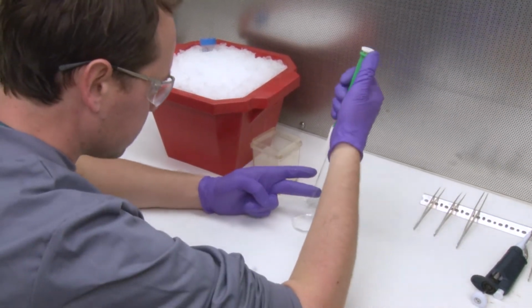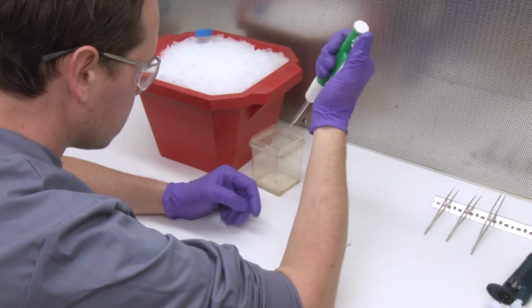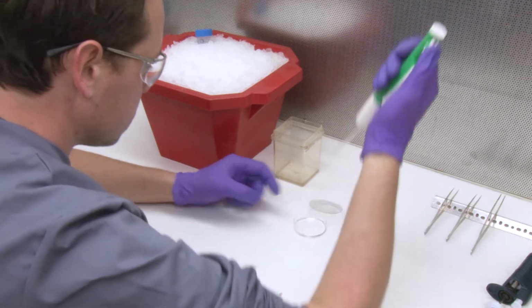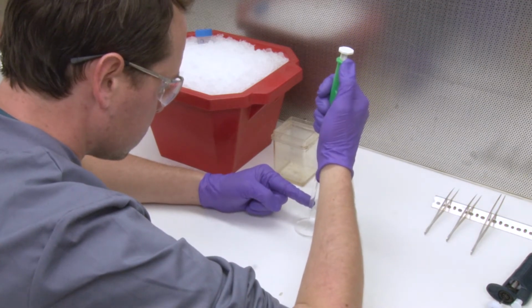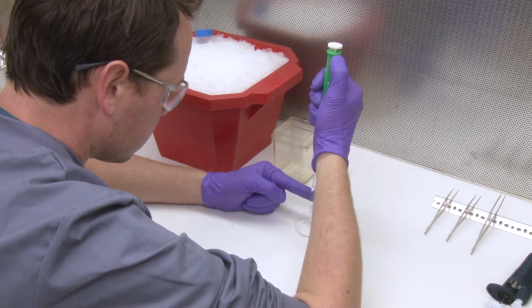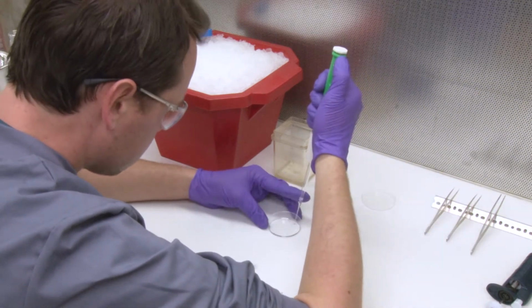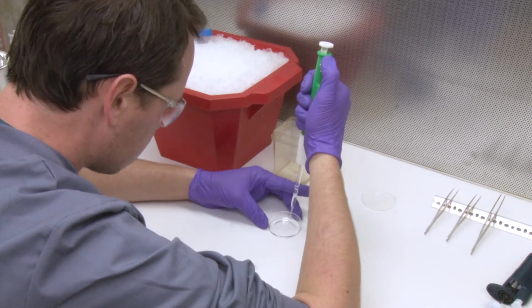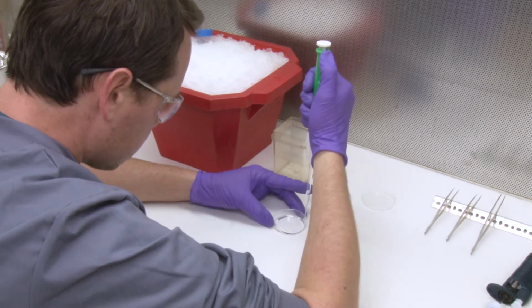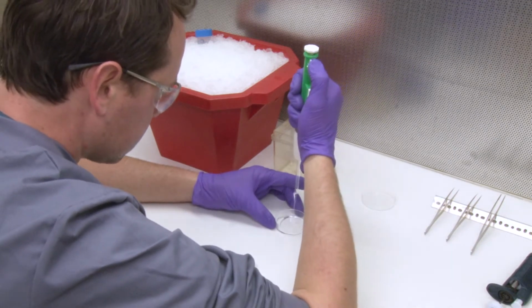Now we're going to remove the half-strength PVS2. A sterile Pasteur pipette with a cotton plug is a good tool to use for this. Try to get all of the solution out, as much as possible.